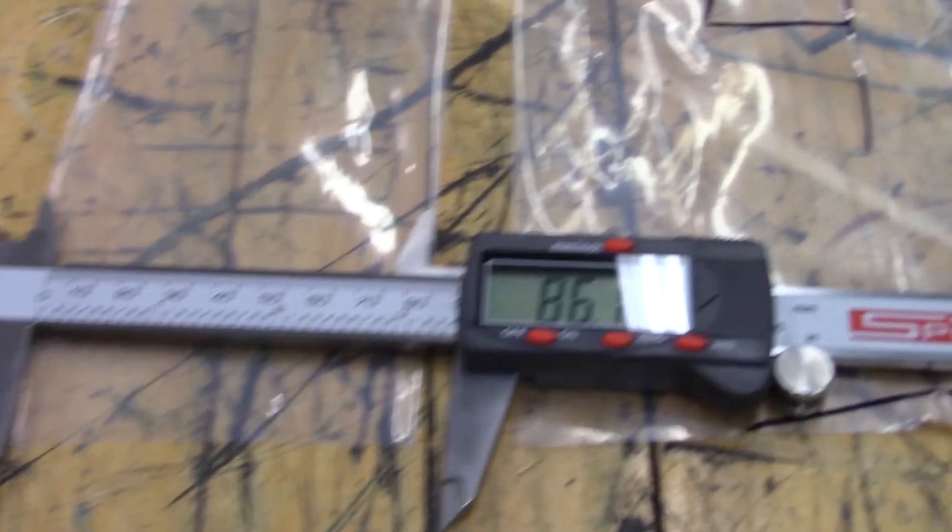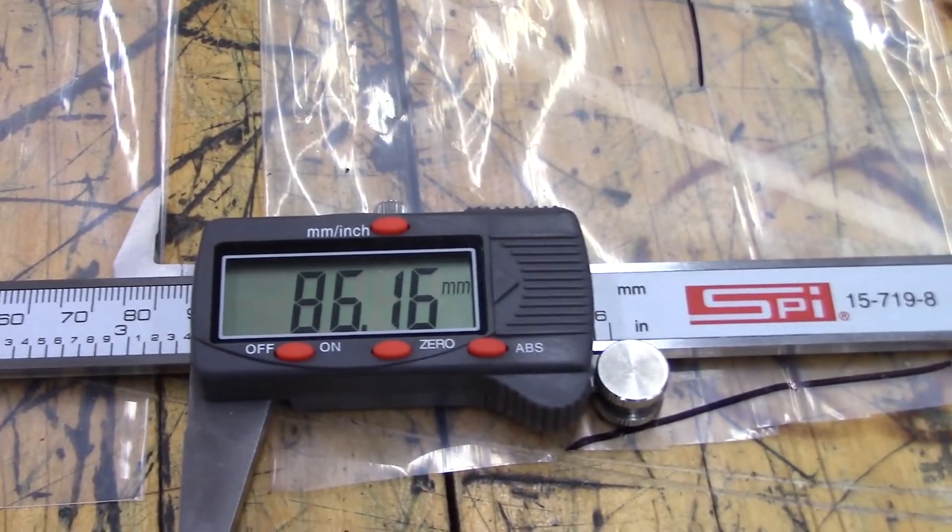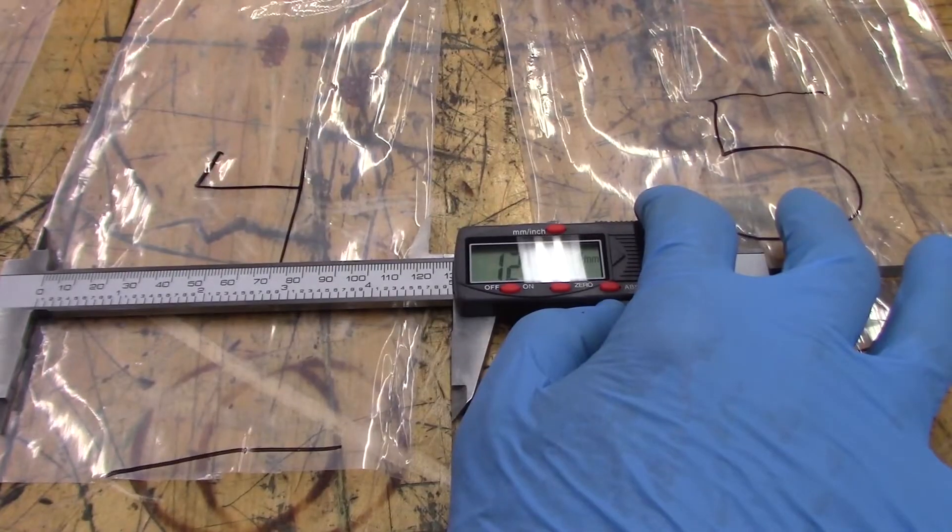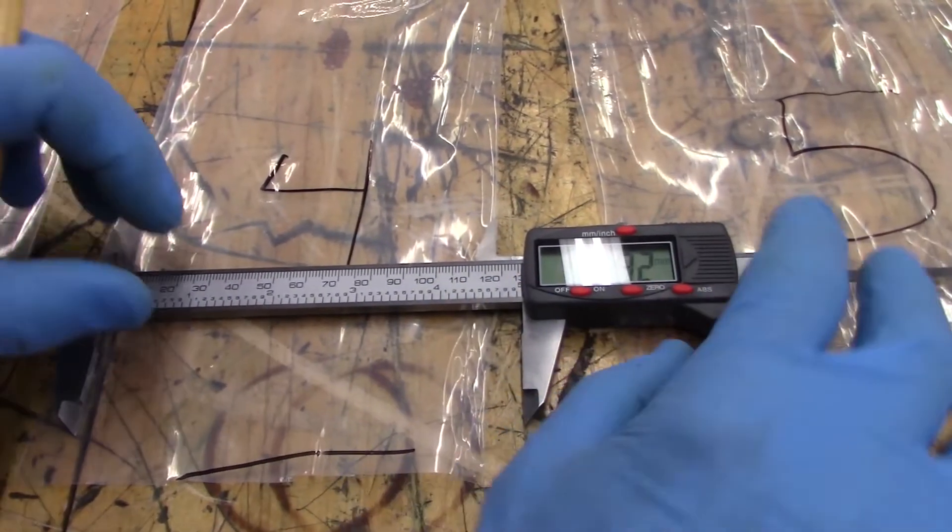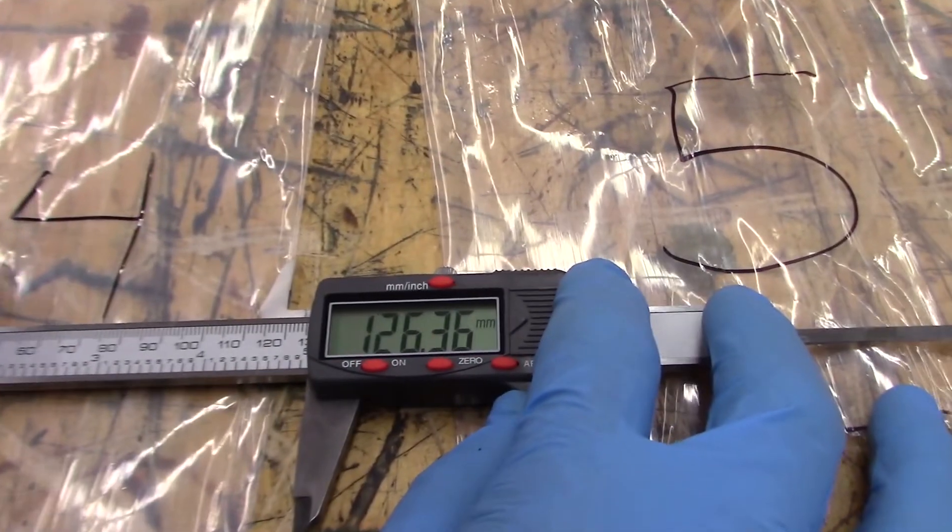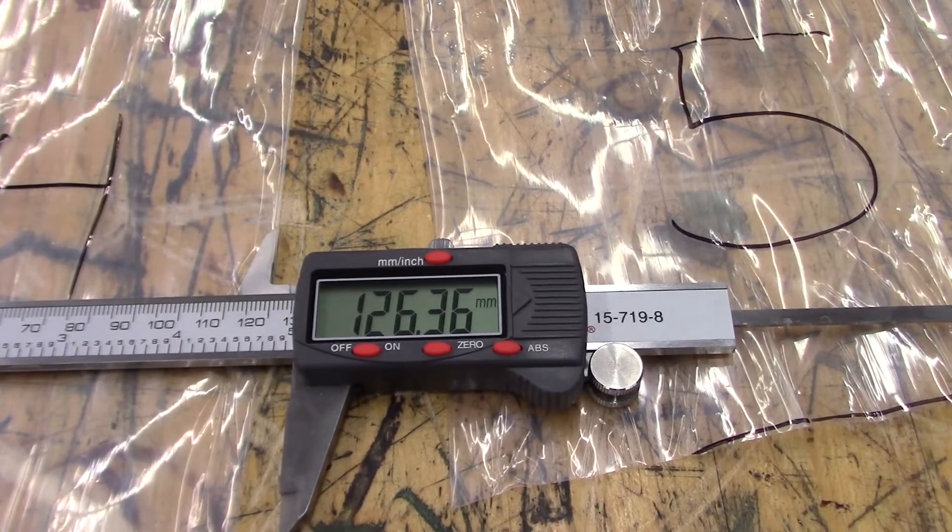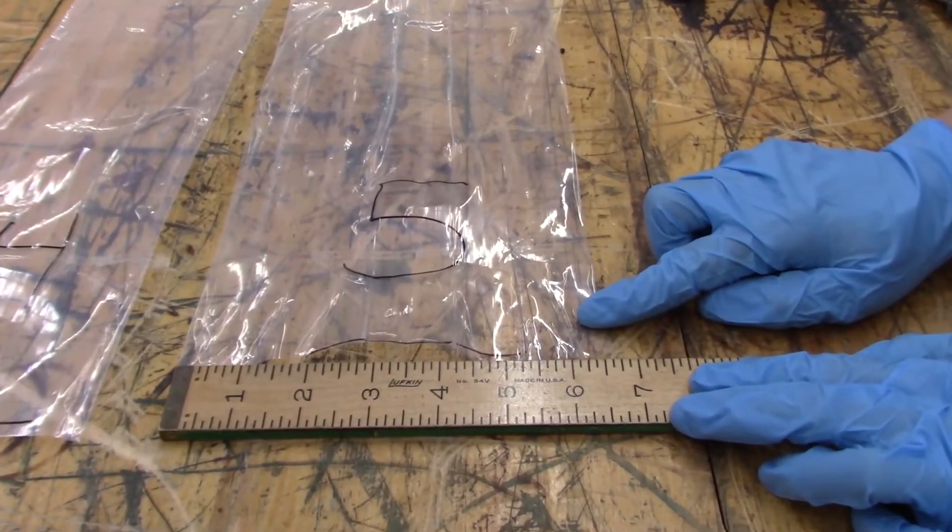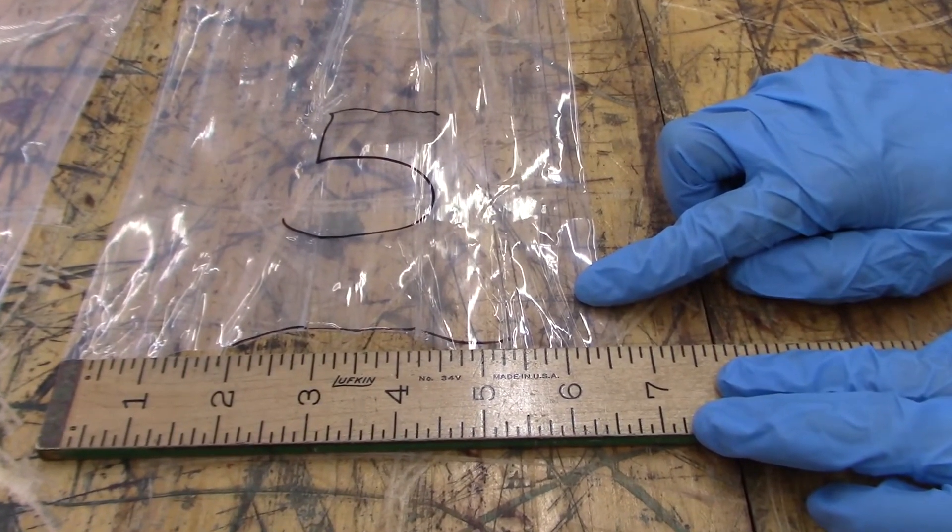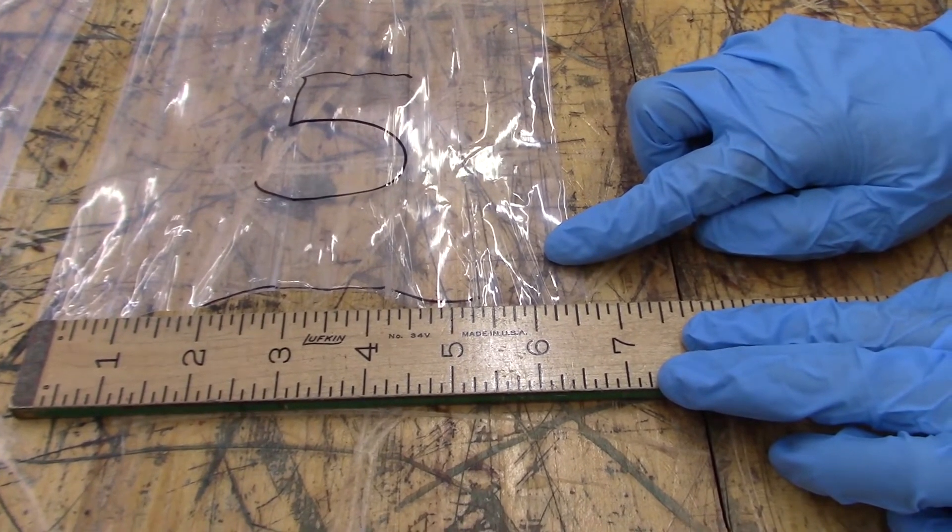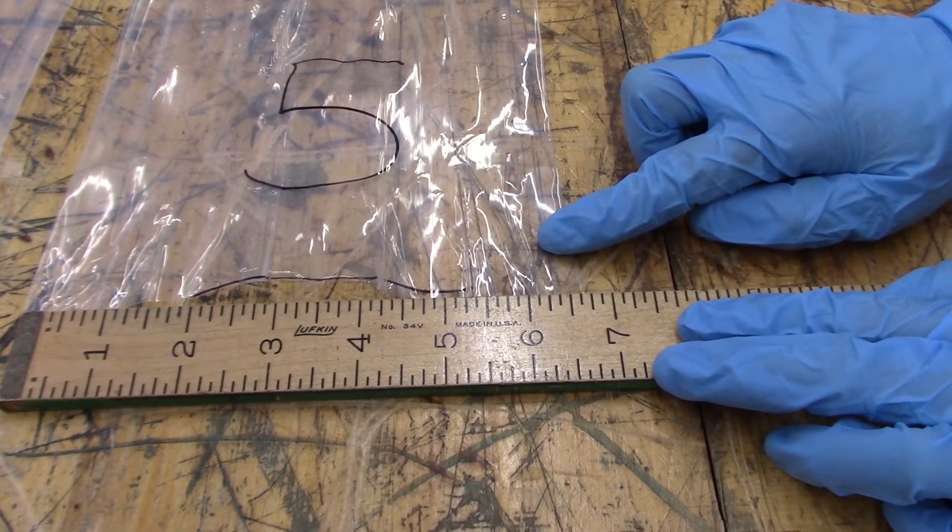Sample 3 has a diameter of 86.16 millimeters. Sample 4 is 126.36 millimeters.